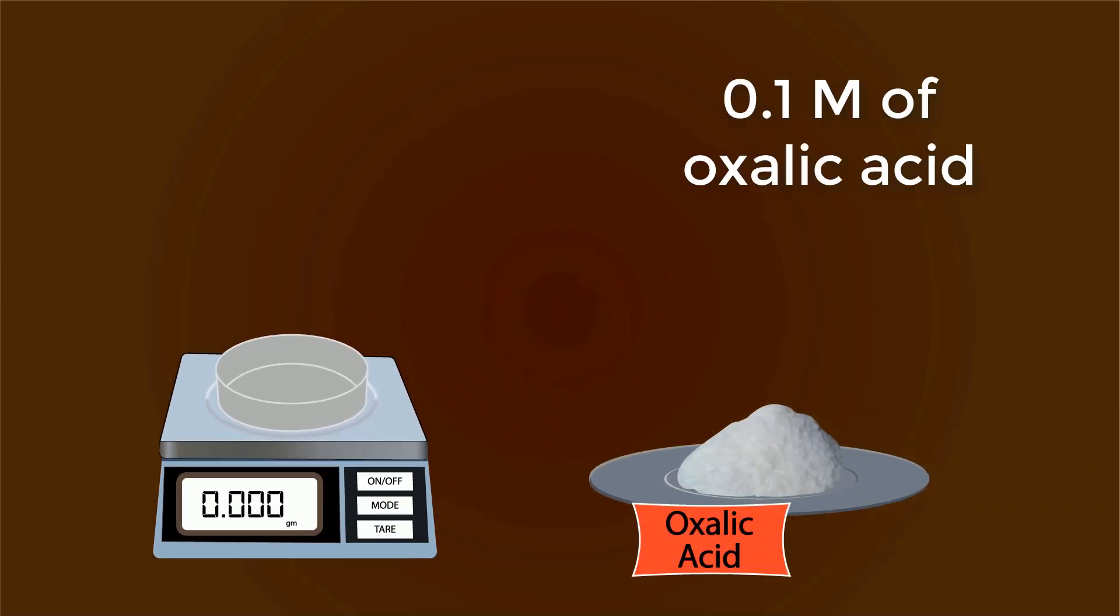In this video you will learn how to prepare 0.1 molar solution of oxalic acid.